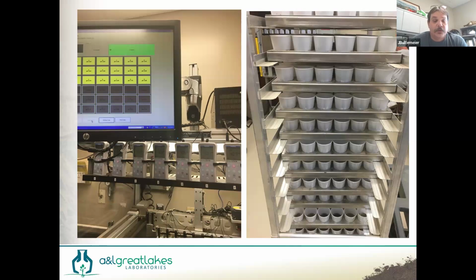So compost, solid manures, soils, growing mediums out of a greenhouse, there are going to be some type of water and material mixture that is used to create a slurry to take a pH. Liquid manures, liquid materials we'll take the pH of them as they are, but they have to be in liquid form to get a pH measurement.